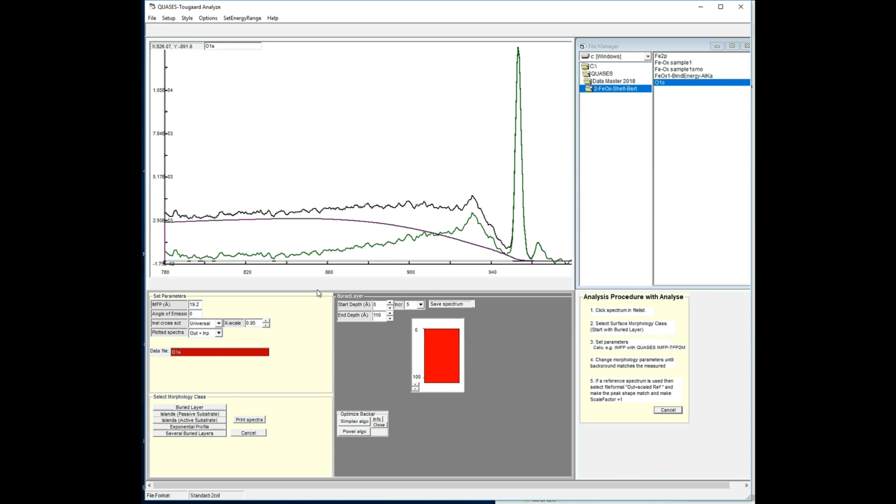That's the thickness of the layer, but we can clearly see it doesn't fit at all in this range, so we need to put something in here, and that's the contamination layer on top of the iron oxide. And I can fine adjust these values and get something like 30, 35, so like 80, 90, maybe 80, something like that. So now we know where the oxygen is. It goes from about 35 to 80 angstroms.